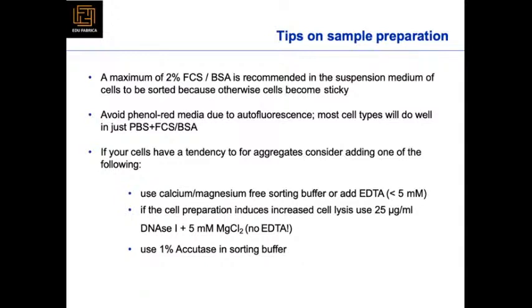So these are the things, students, you have to take care of when you start your experiments with FACS analysis, so that the results are better, there should be no background noise, no false readouts. Everything that you're doing is done right.